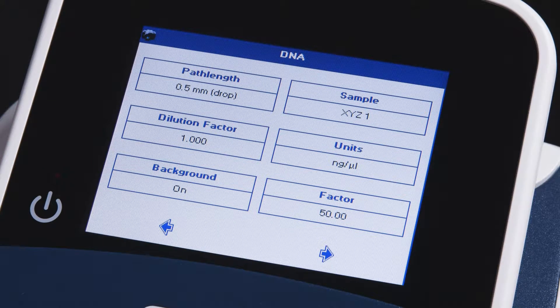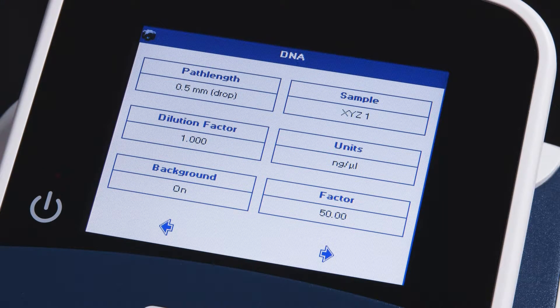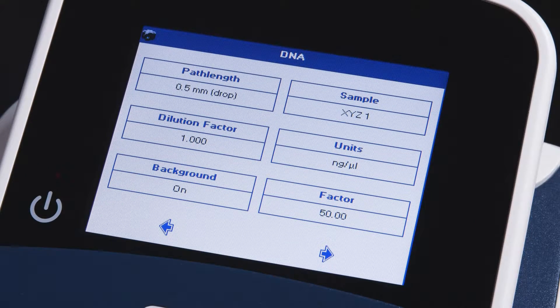Finally, you may change your concentration factor. Because we're reading DNA in water, we'll leave this value at 50.